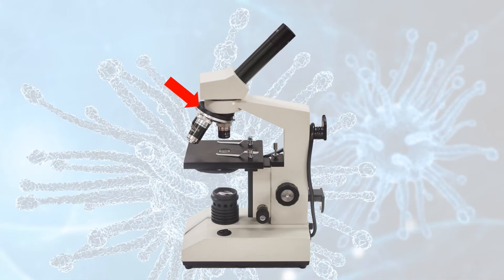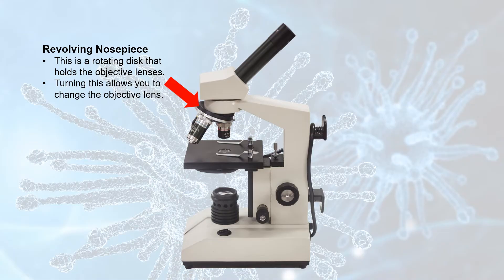This part right here is called the revolving nose piece. It's a rotating disc that holds the objective lenses. You turn it to change from one objective lens to another.